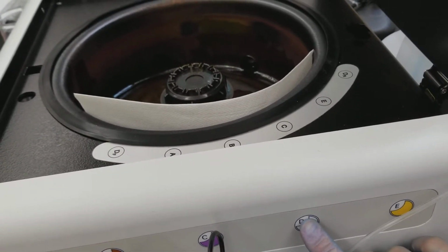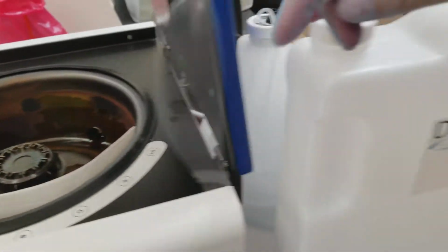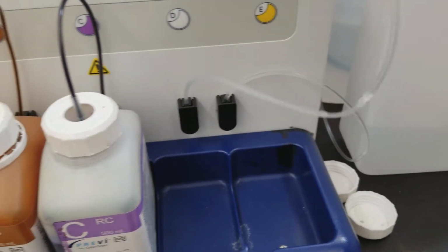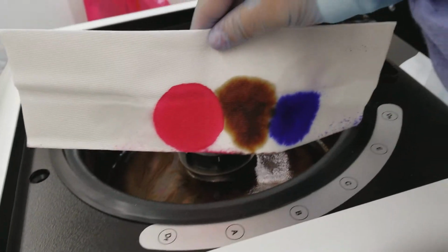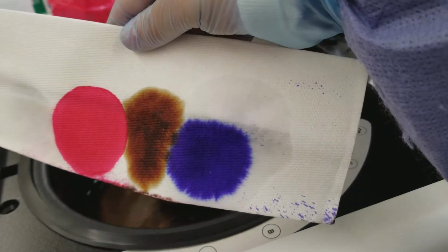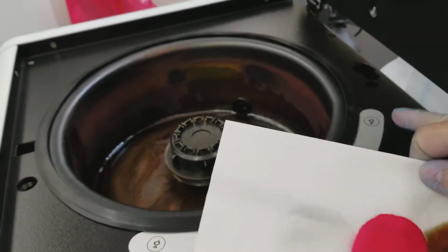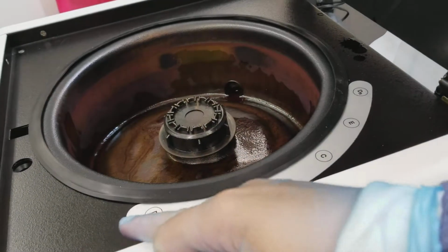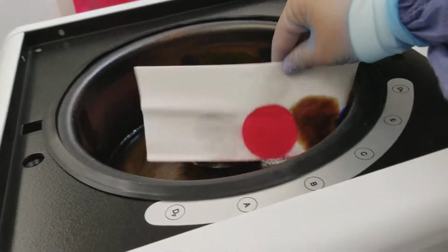So, all right, I saw the tubing move. There are no bubbles in the lines. That's something you also want to look for in all of these, is if there are bubbles, that shows that something's wrong. And notice that both areas where there is water that comes out, the first and the last one over there, they are perfectly circular as well.